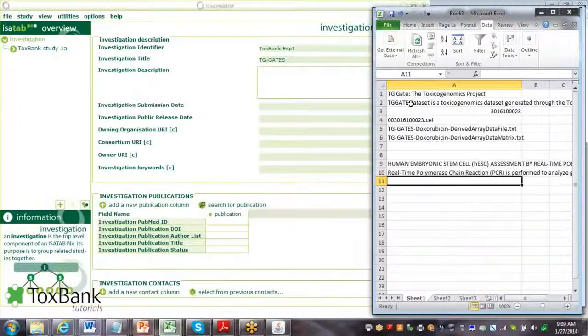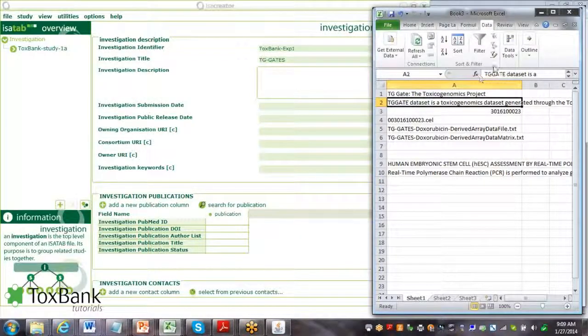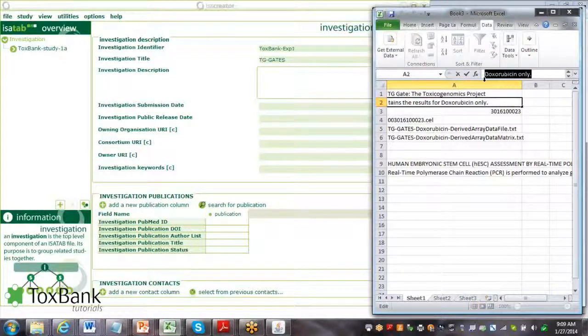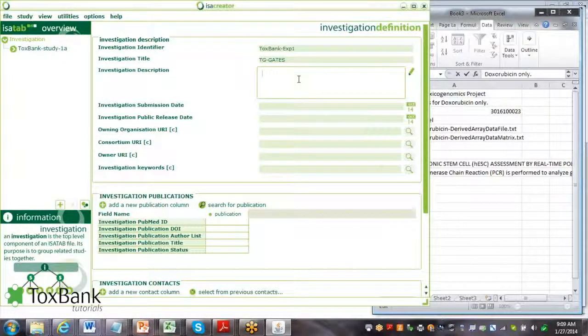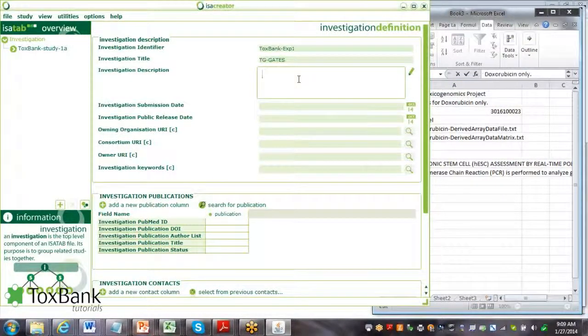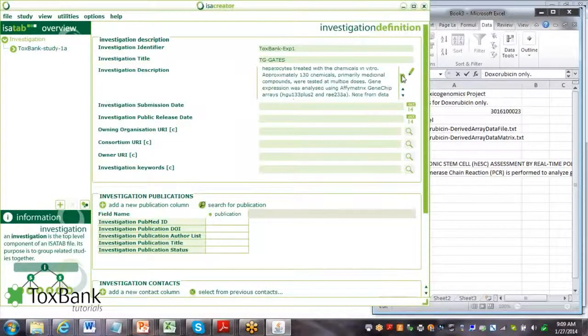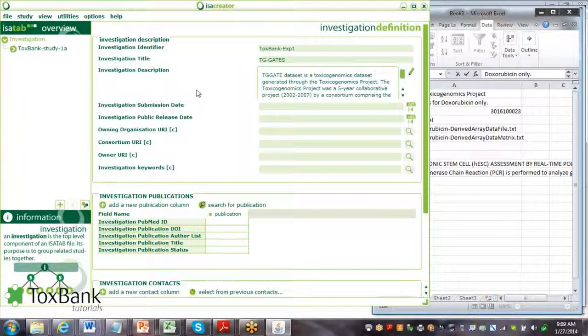I do have in here an abstract which I'm just going to copy rather than type in directly. You would just either type in or paste in an abstract for the investigation.